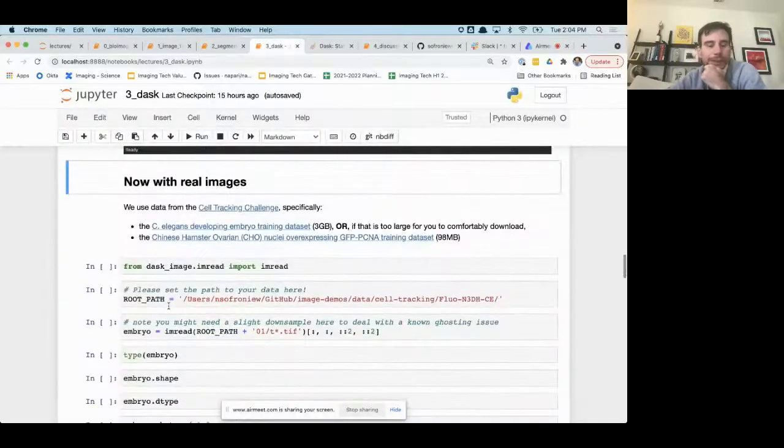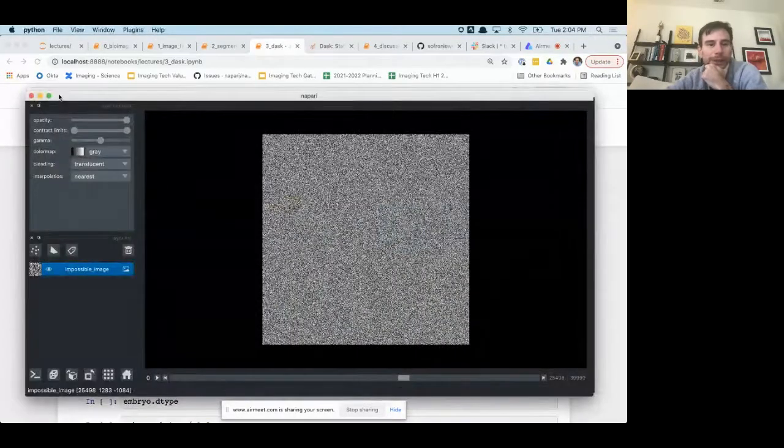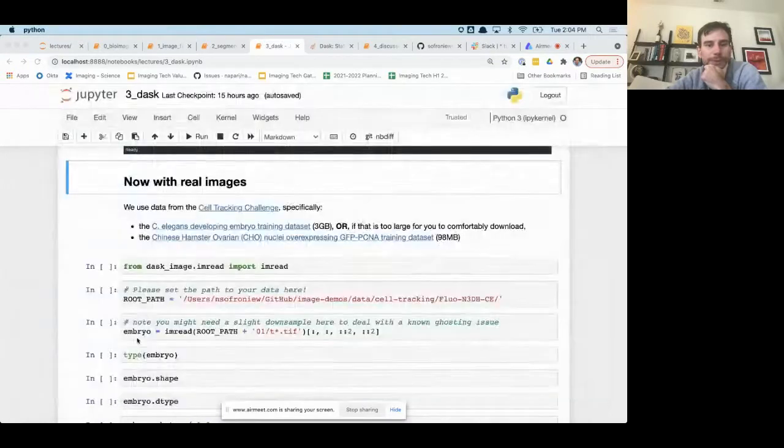So we can come here. I'm actually going to come back. I can close these Napari windows. I'm going to use them again.